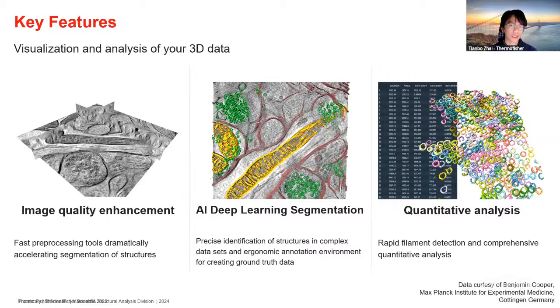Every pixel is being classified as class 0, class 1, or 2, something like that. And those label images can then be transferred. It is pretty lightweight. It only contains the integer values. So those will become the so-called transferable annotated image. And then another person can open that and continue with the annotation part.